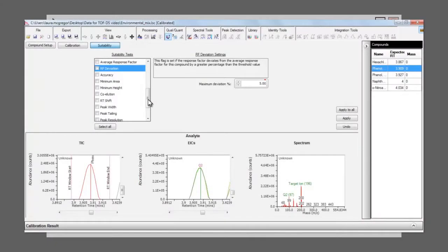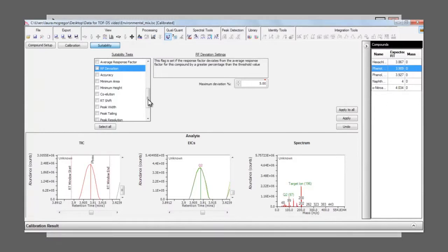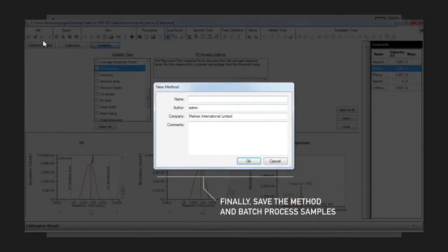As before, these settings can be compound-specific or easily applied across all of the target analytes. The method is now ready to be saved, making it available to use within the sequencer as part of a batch process.